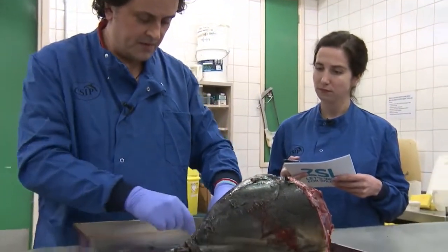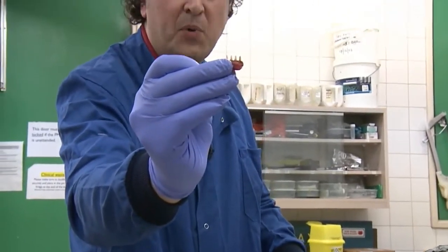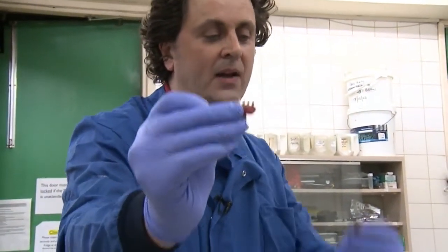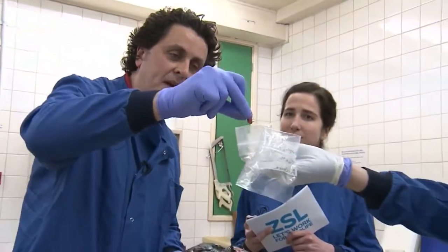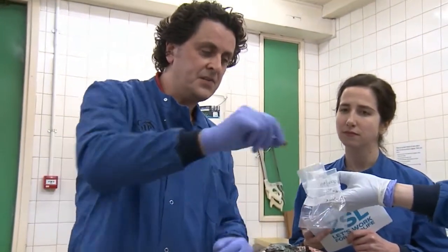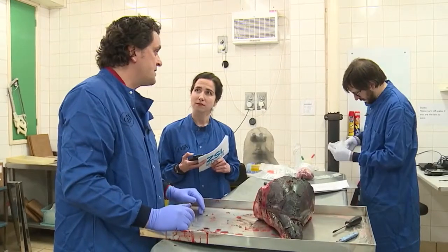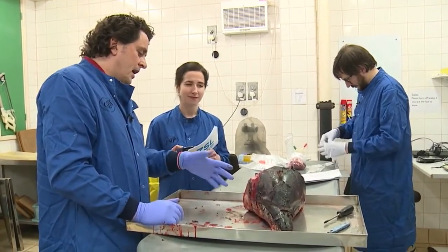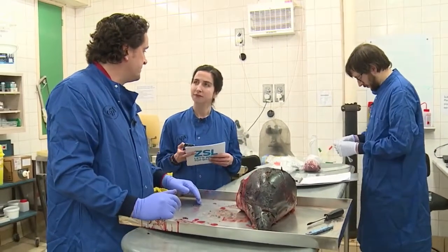Okay, so I've taken some teeth out. Matt, I'll pass these through. So again, to show the camera, I think we saw them earlier, but you can see they're very pointed teeth, and that reflects their feeding ecology. They're chasing fish through the mid-water column. They've got to catch those fish and then acrobatically throw them through the mid-water and then swallow them head first so the fins don't get stuck down the throat. And we collect those because we can use those to age them. So just like trees, essentially, there are rings or lines on the inside of the tooth. Every year you get a deposition layer or line, and that's how we age them. And this animal, I guess, would be between 3 to 8-ish years old.